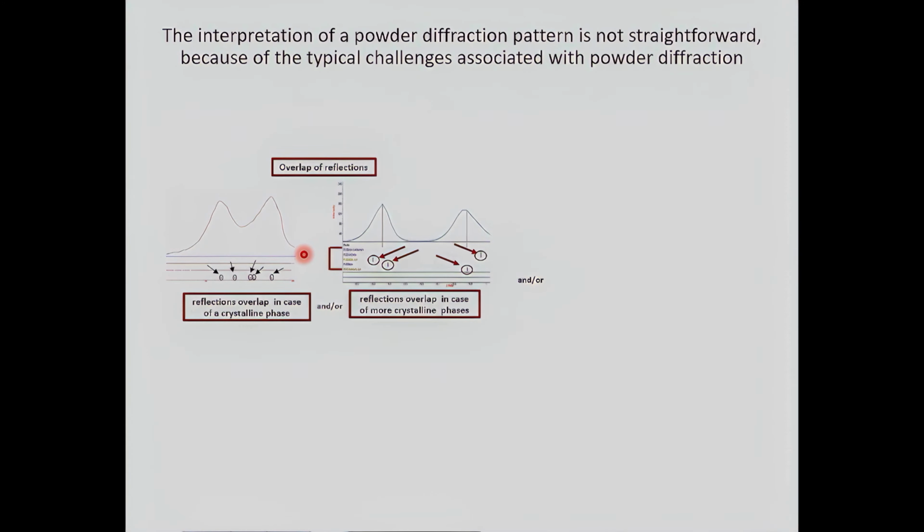We have access to only these 2 peaks, but under these two peaks we have the contribution coming from 5 reflections. And to characterize the compound, we need to assign the corresponding intensity to each of these reflections as correctly as we can.